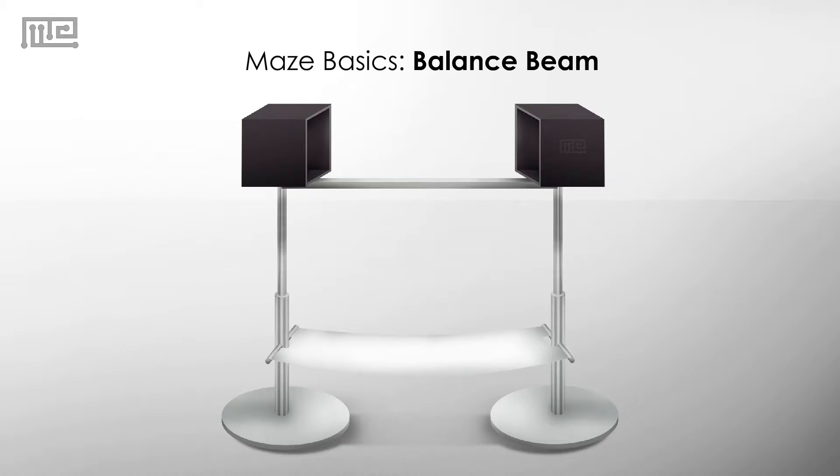The rodent is placed at the starting end and then is encouraged to cross the beam to the other side. Since crossing the bar takes balance and coordination, the balance beam is a good test of motor coordination. Motor coordination is most commonly measured by the amount of time the rodent can walk across the bar before falling off and by the number of foot slips. In rodents, the hind limbs are not usually used for complex movements, so the number of times the back foot slips off the beam is a good indicator of hind limb functioning.